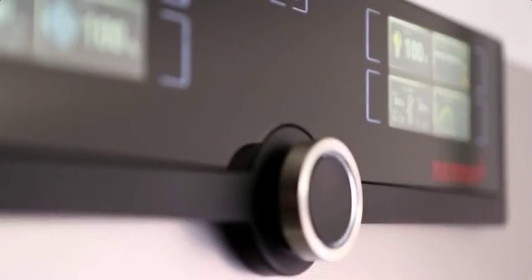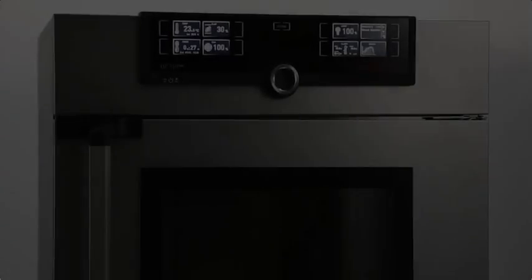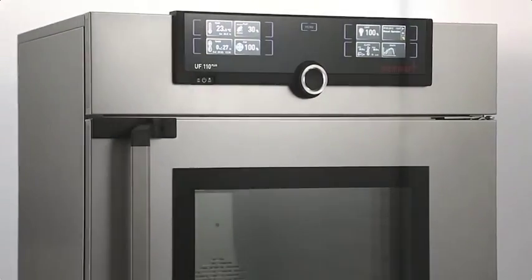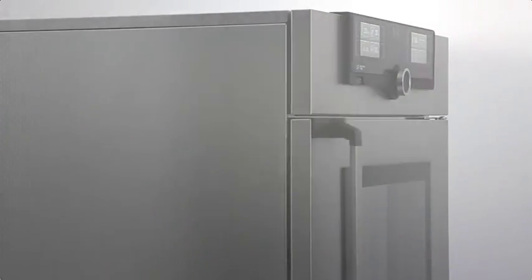Beautiful, elegant, aesthetic — made in Germany. The new Generation 2012 by Memmert raises the bar. It's good when beauty and function don't exclude each other, but it's even better when beauty is functional at the same time. For more than 30 years, the outer housing of Memmert appliances has been made of unique structured stainless steel — scratch resistant, easy to clean, and a pleasure to the eyes of those who appreciate aesthetic modern design.